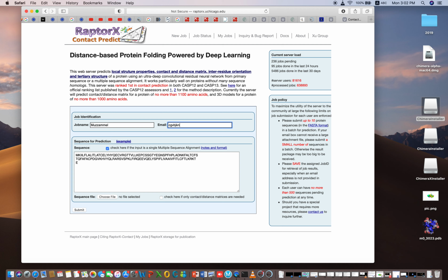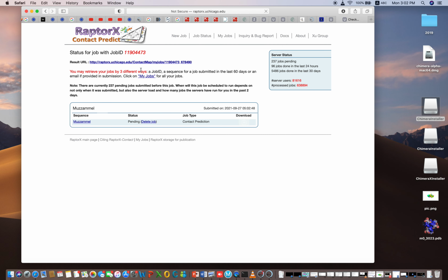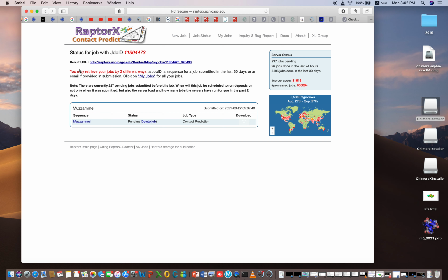I'm not providing it this time. So if you submit your job over here, your job is submitted. You can check the status of your job. It is still pending, and you will have to periodically check this page to know the status of your job. Either way, you can save this URL address, and by clicking it you will be able to get the results.